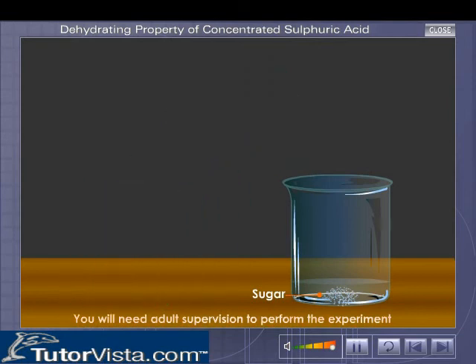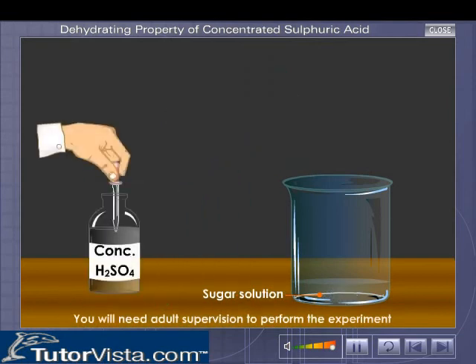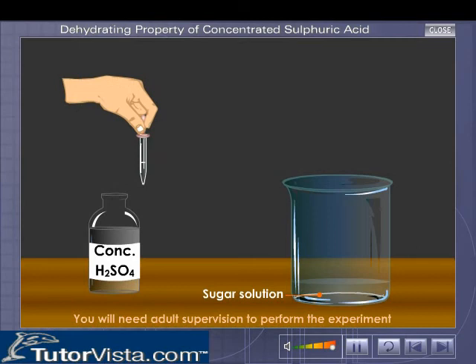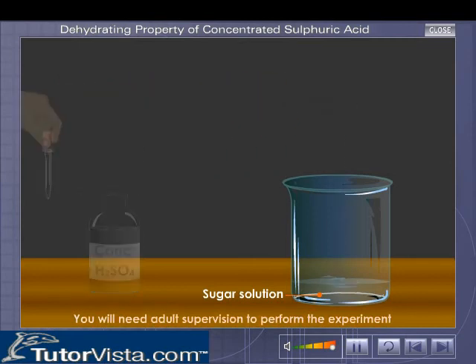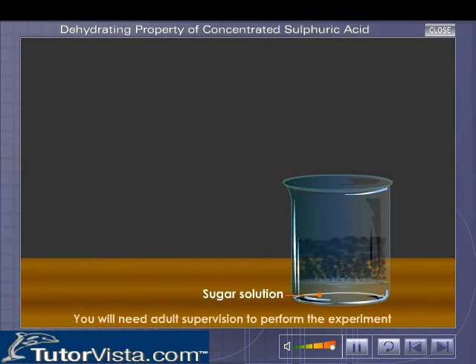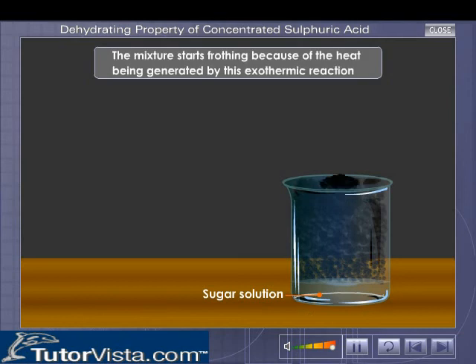Now slowly add concentrated sulfuric acid into the beaker containing sugar. Observe what happens. Can you see the effervescence?